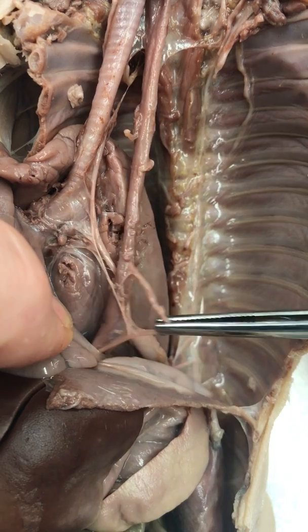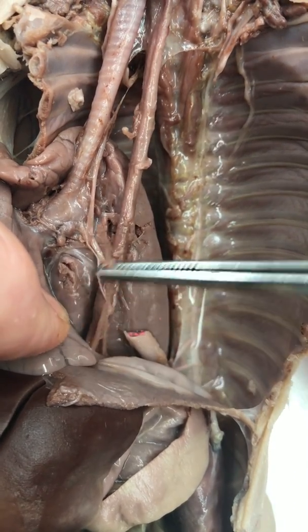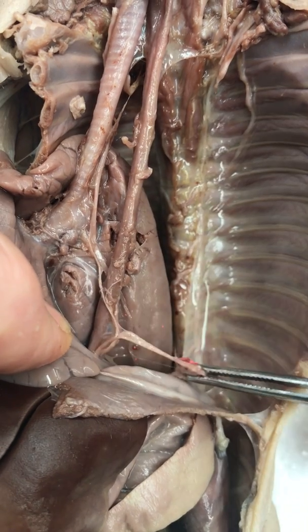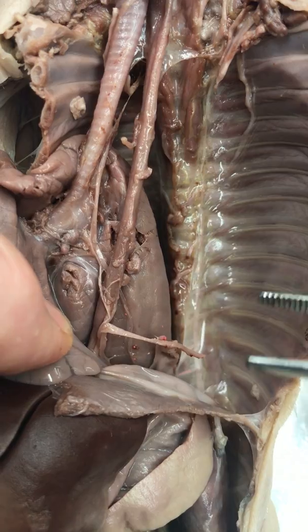There's that vein or nerve. Sorry, I cut the vagus nerve. You're never going to breathe again. This is the end of the aorta right there. Sorry, you're gone too. Dead.